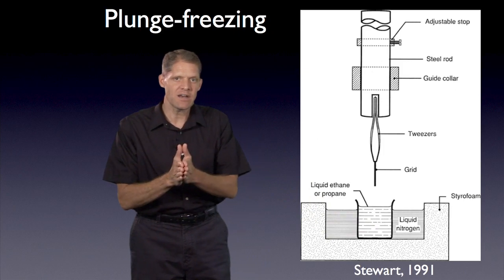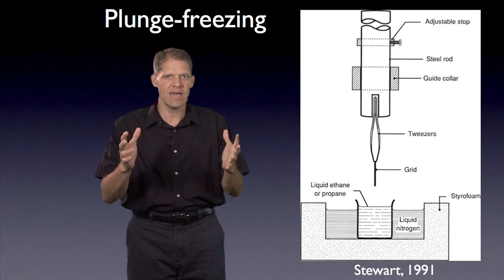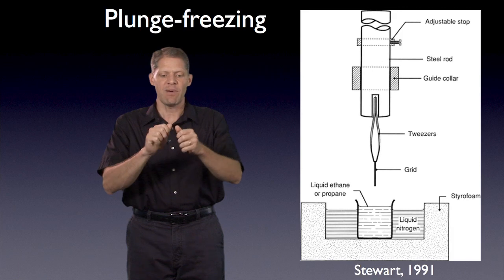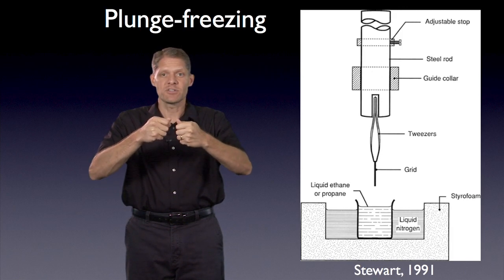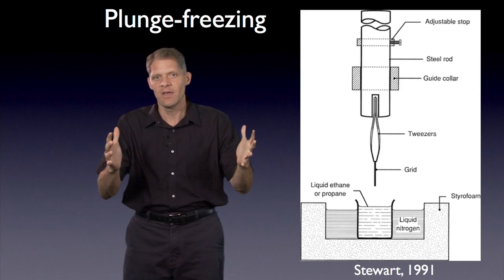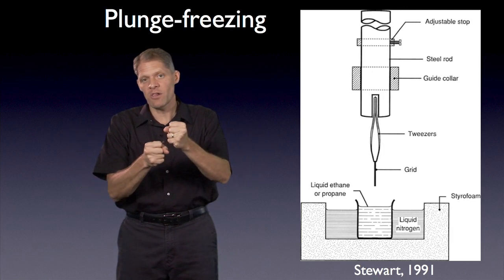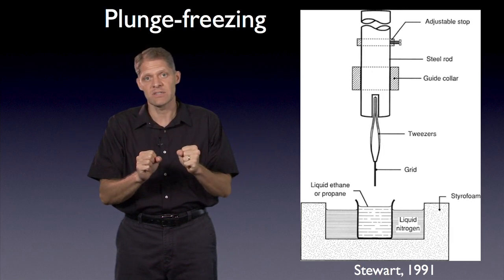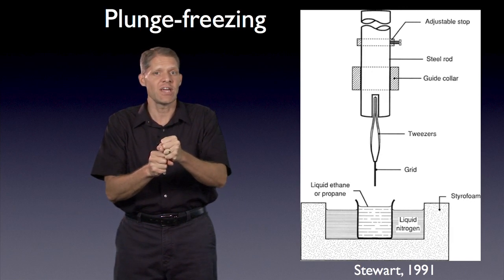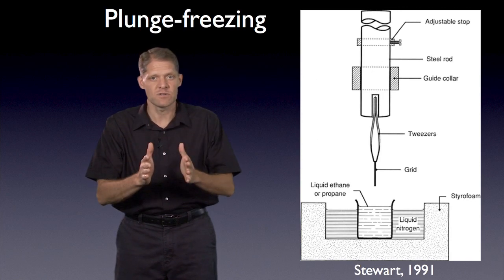And if the sample is thin enough, heat comes out of the sample so quickly and into the ethane that the water molecules don't have time to bounce around and find partners to hydrogen bond with, so they can't form an extended crystal. Instead, the kinetic energy comes out so quickly that the water molecules and all the other molecules present simply stop moving wherever they are before they have a chance to crystallize. And all molecular rearrangements are frozen.